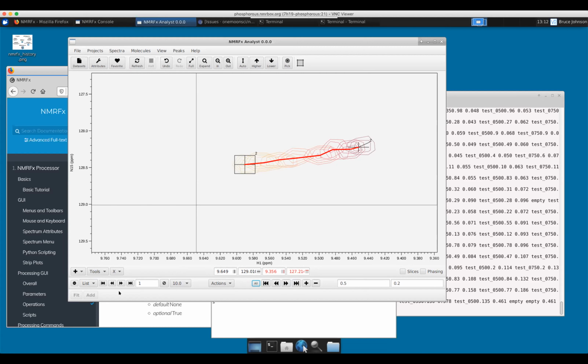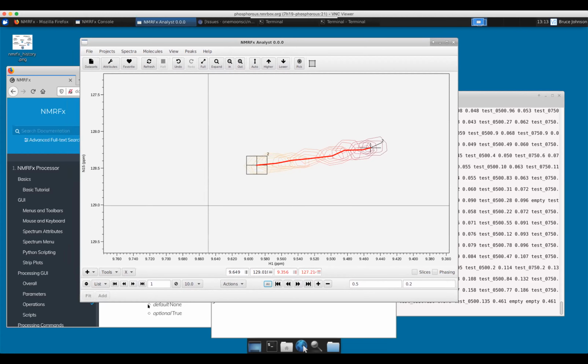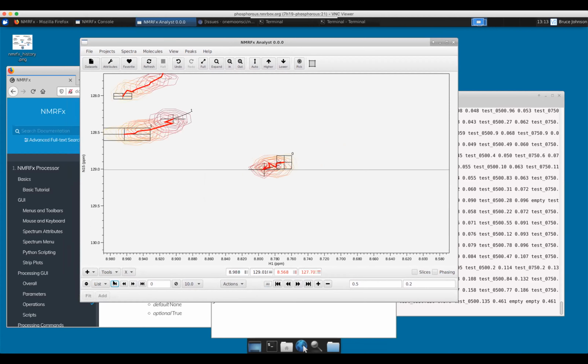But I'm kicking myself because I tested this yesterday and discovered the problem that I just fixed. And why is this fit button not getting activated? Total mystery.